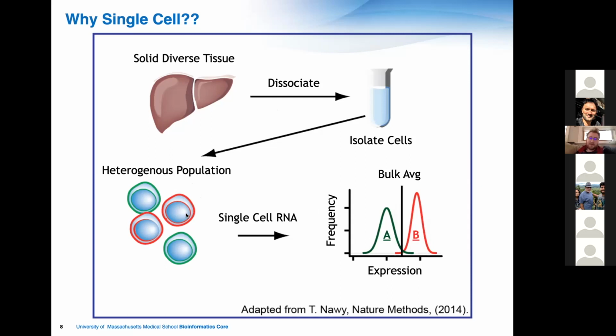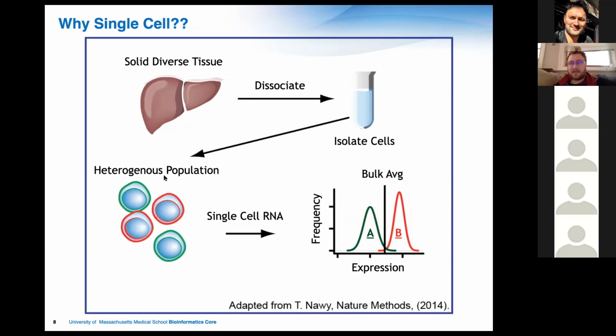So some genes might not be different at all between these red and green cells. So, just like a qPCR experiment where you might use a ribosomal protein or GAPDH for normalizing your qPCR data, the same principle holds here. There are some genes that are going to be the same regardless of which cell type that you're looking at. But at the same time, there are some genes that are only expressed in a single cell type. And so those are genes where you're going to have two discrete populations as far as the distribution of gene expression values.